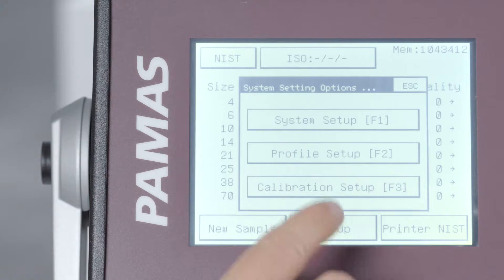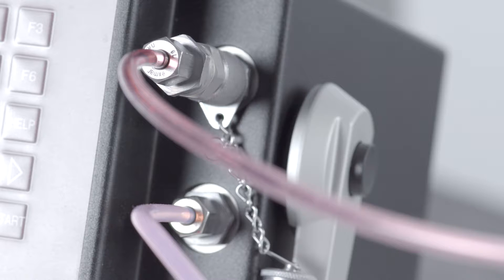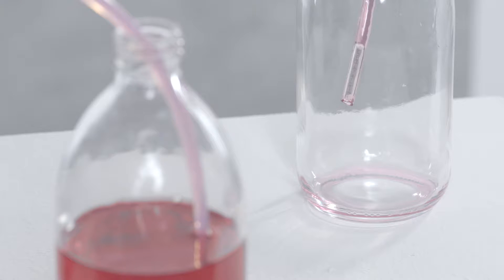Thanks to the sophisticated touchscreen, operation can be done directly on the instrument. All measuring parameters are freely selectable and can be adjusted to the user's specific application.